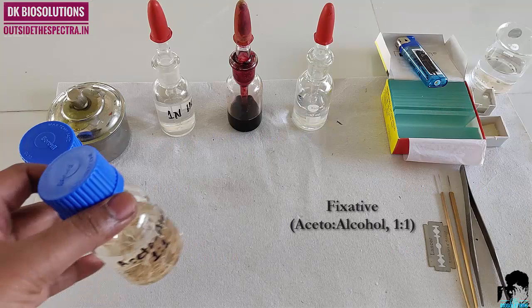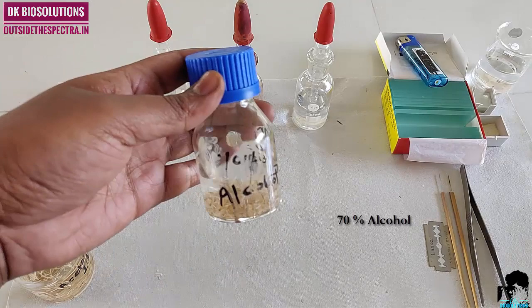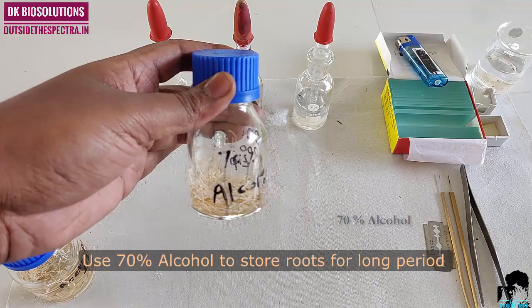We need acetoalcohol fixative. It fixes root tips and prevents further changes in cells. Keep roots for one hour in fixative for fixation. We use 70% alcohol to store roots for a long period.